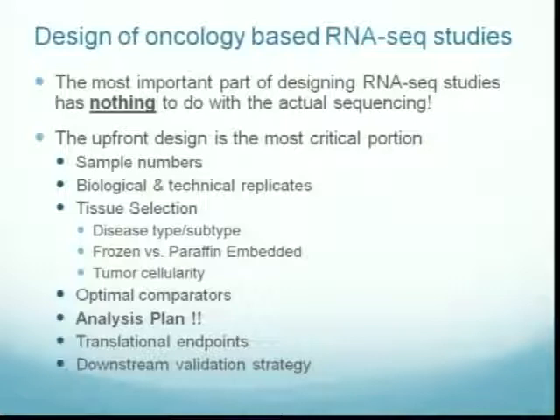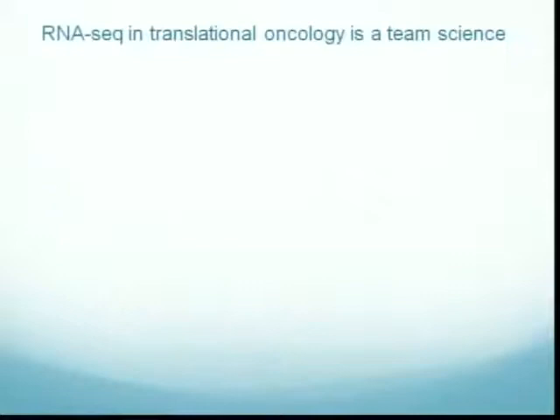I can't stress enough an analysis plan, sitting down with people like Yun Long and bioinformaticians to really hash out what your analysis plan is ahead of time. Your translational endpoints: if you're going to work in oncology, how can we apply this to the patient? And what is your downstream validation strategy? Once you're done with the study, how are you going to validate your findings from your RNA-seq?